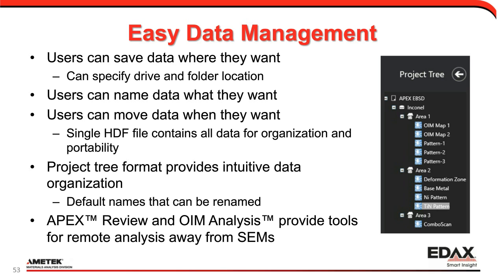So it's easily transportable, but it carries all the data with it. It can carry multiple patterns, multiple scans, and EDS and EBSD data together. And by having it organized in a project tree, it's an intuitive data organization. You can see when we collect the data, it can give default names.